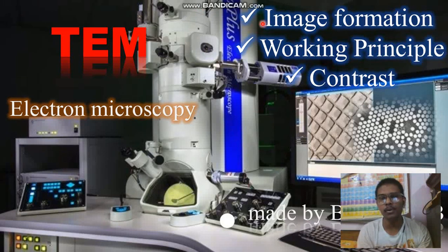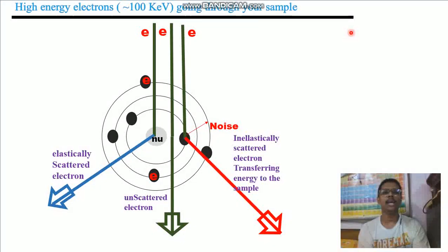This video will cover image formation in the transmission electron microscope. What is the working principle? What is the basic scientific background of transmission electron microscopy? We will get into that in this video. If you want to know the basic principles and working mechanism, what is happening inside the microscope, this video is for you. Just keep watching.